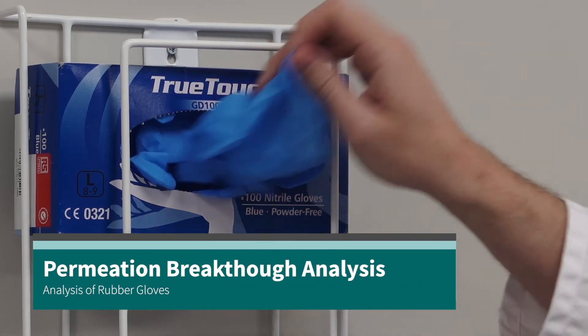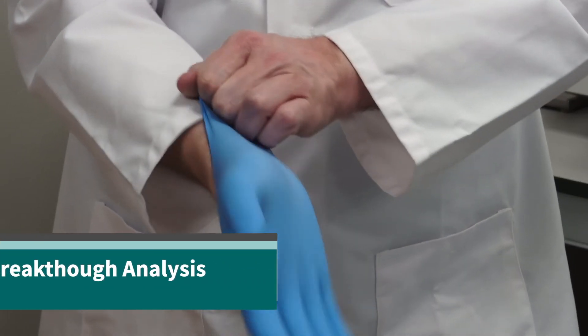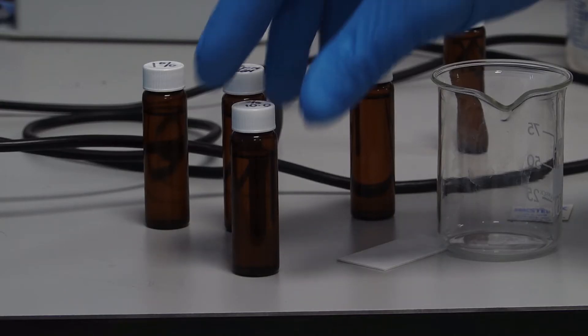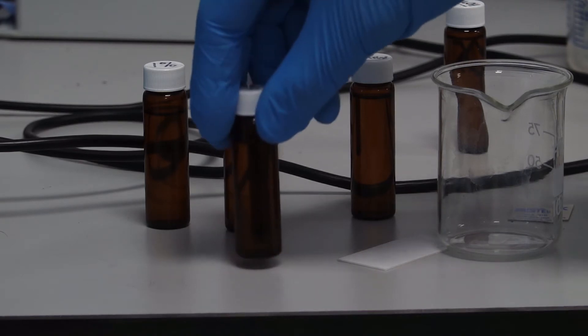Rubber gloves are an essential piece of PPE worn to protect the user from potentially harmful substances. But how do we know that the gloves offer a suitable level of protection? The answer is permeation testing.